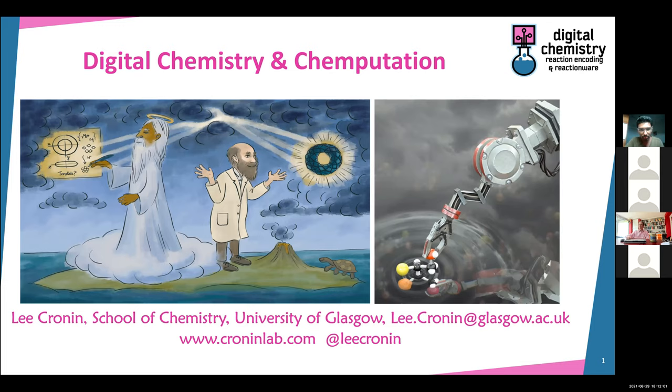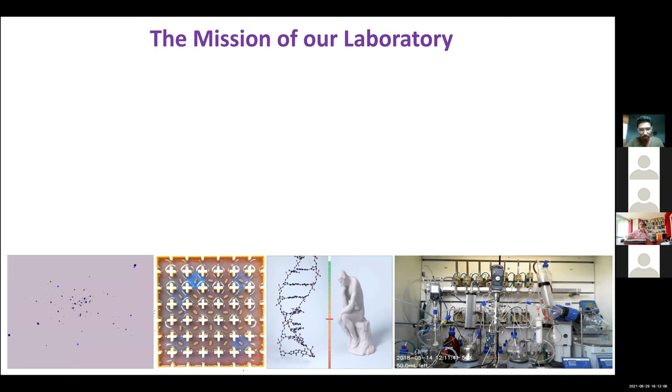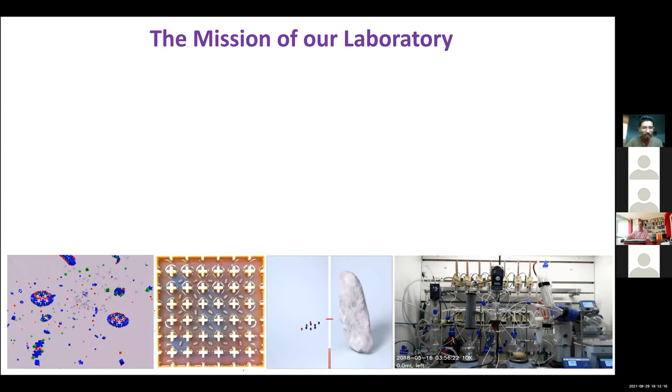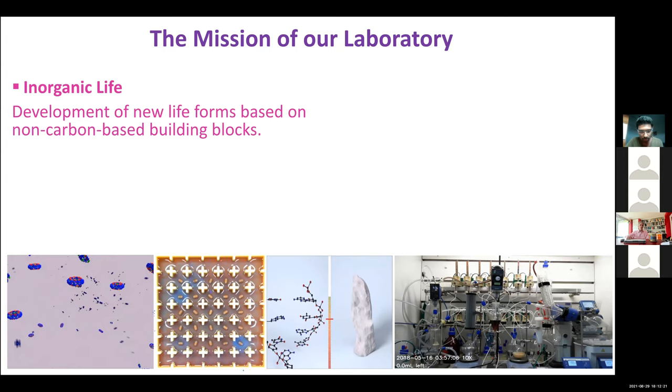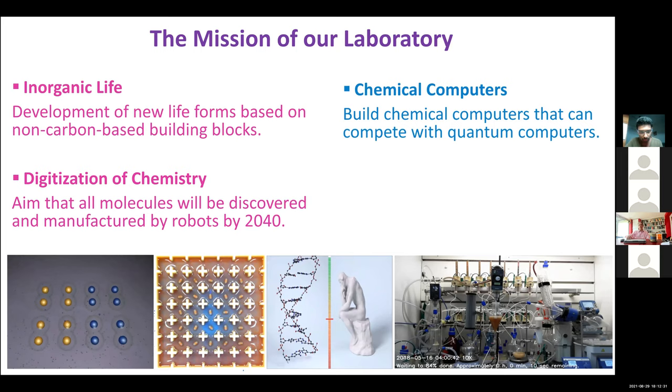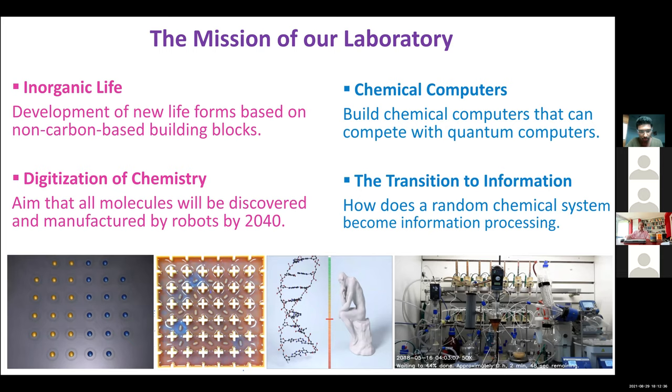So what is the mission of the lab? Can you let me know if you can see the animations, okay? Can you see the videos moving? Yes, we can. Okay. So the mission of the lab is four things. We want to make inorganic life, developing new life forms based upon non-carbon-based building blocks. We want to digitize chemistry to make molecules using robots. We want to use chemistry to do computation. But all of this is really about understanding how chemistry processes information and what even that is.